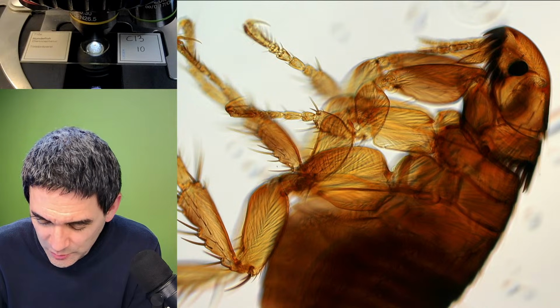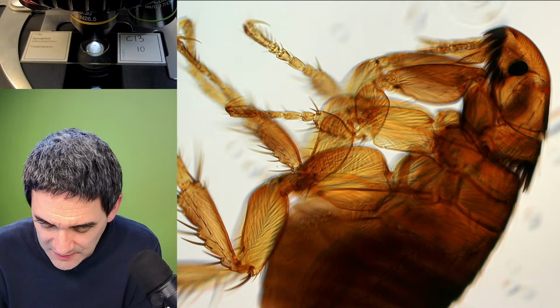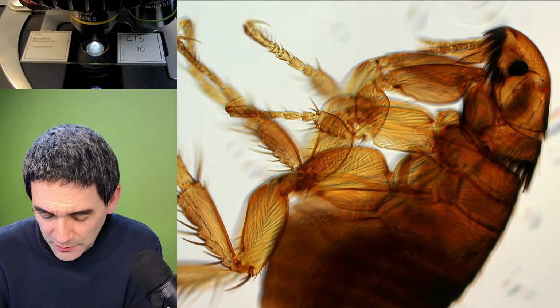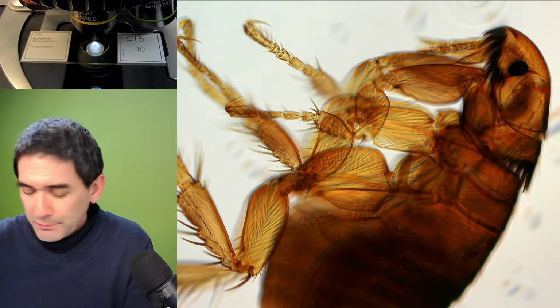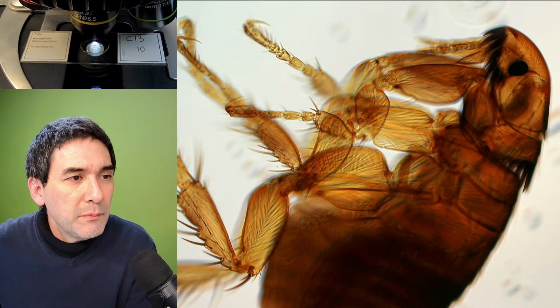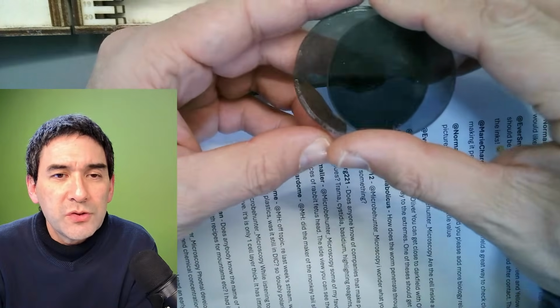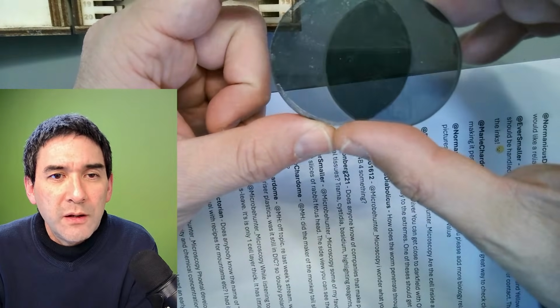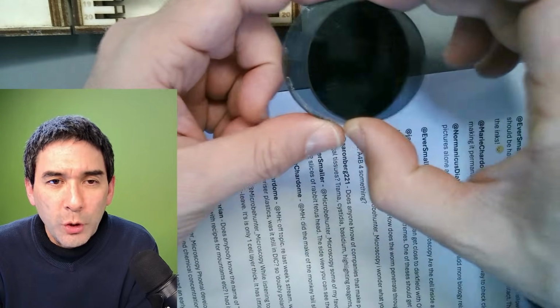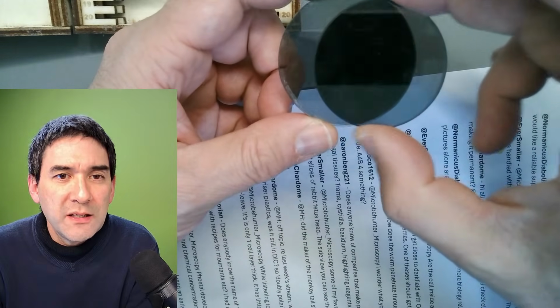In last week's streams, when you showed the viewer the use of the 2 polarizing plastics, was it still in DIC or doubly polarized? When I polarized the plastics, no, what I've done is, let me show you. No, that's the wrong one. I've got some polarizing filters here. You can use plastic filters, and basically what I've done is I've simply placed one on top of the slide and one over the lamp, and I removed everything else. So it was just basically cross polarizing.